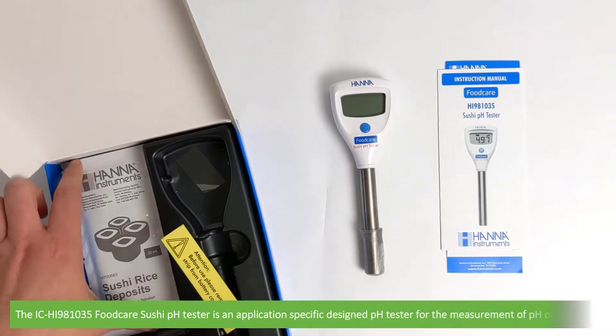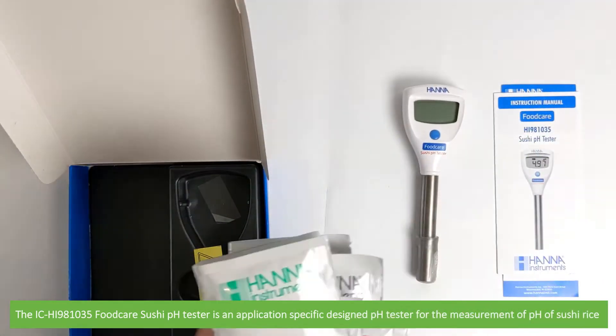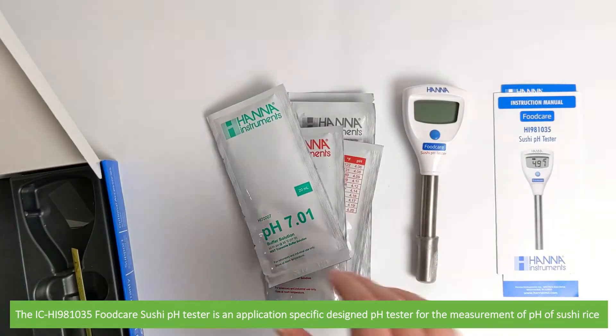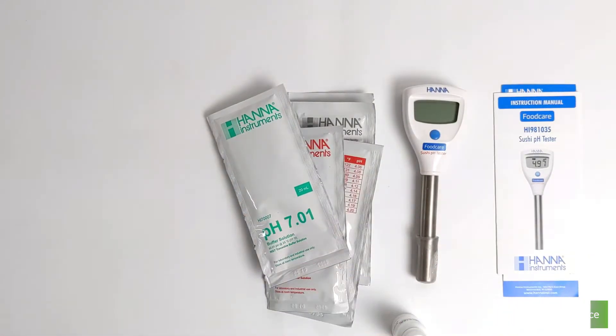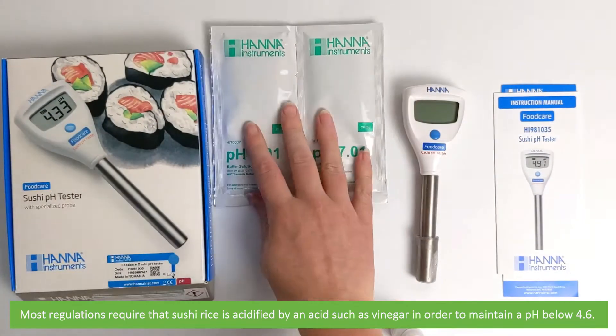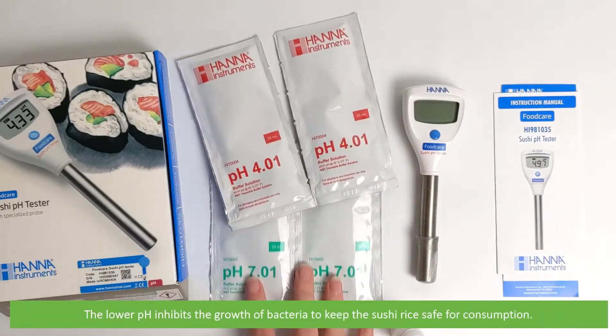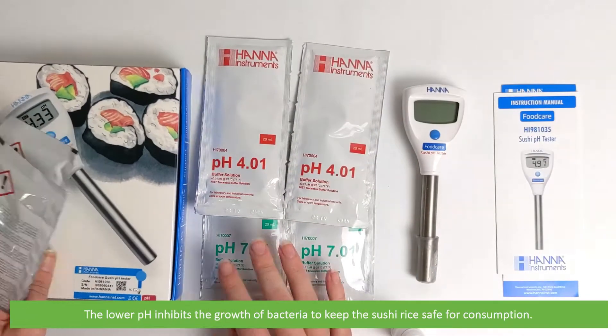The IC HI-981035 Food Care Sushi pH Tester is an application specifically designed pH tester for the measurement of pH of sushi rice. Most regulations require that sushi rice is acidified by an acid such as vinegar in order to maintain a pH below 4.6. The lower pH inhibits the growth of bacteria to keep sushi rice safe for consumption.